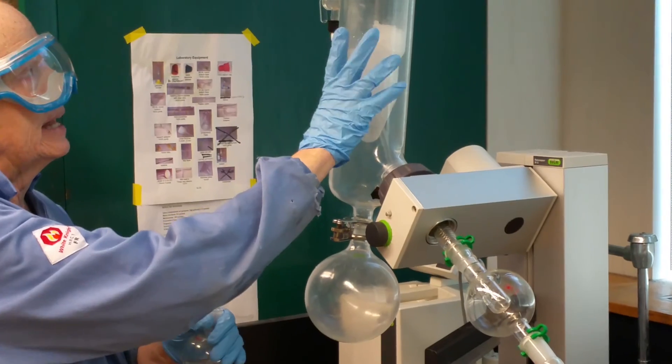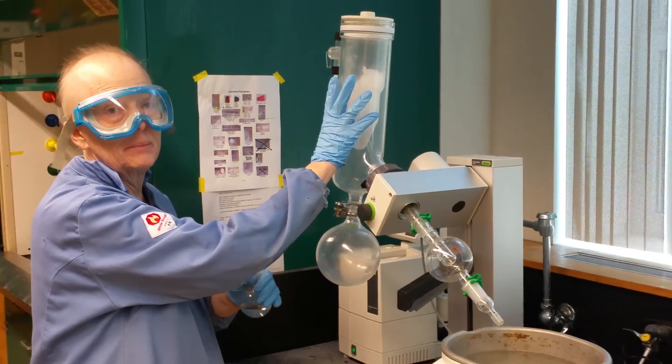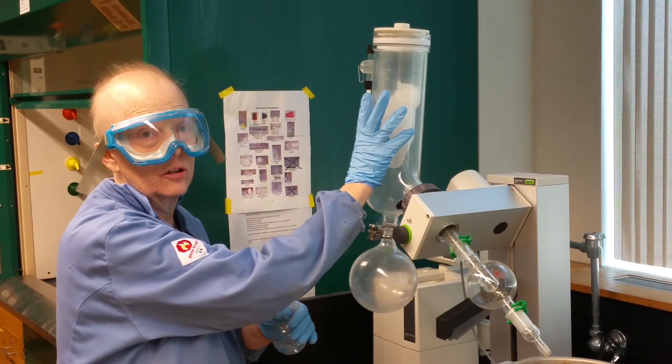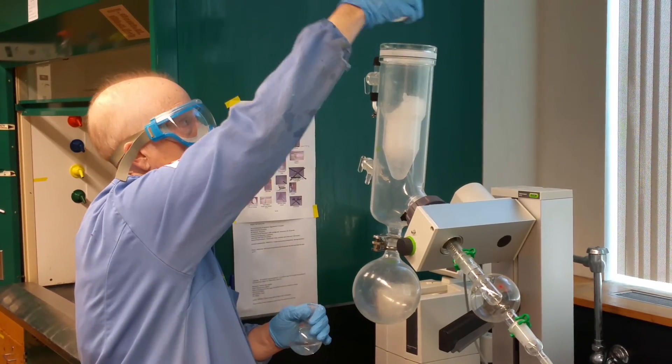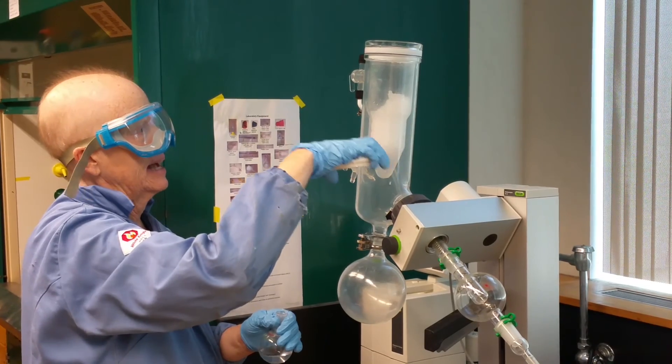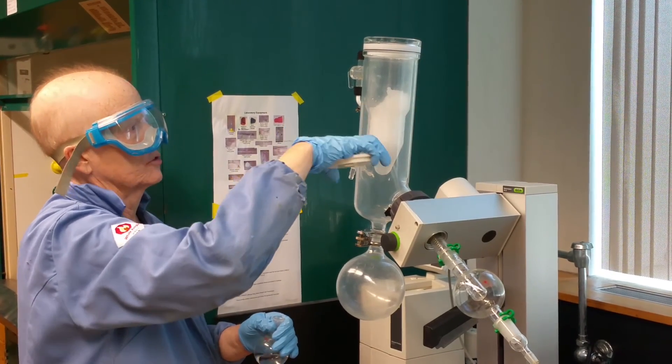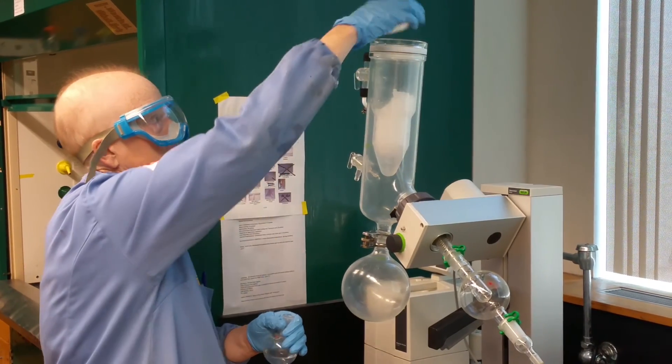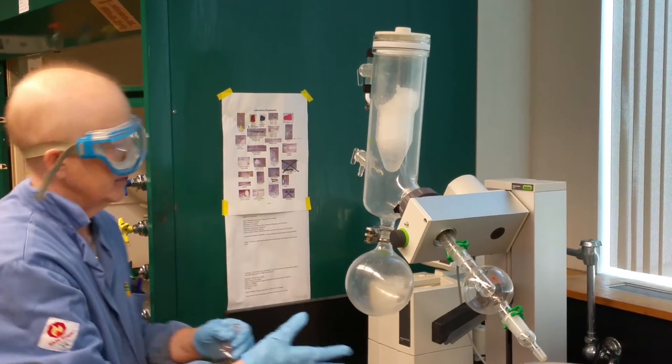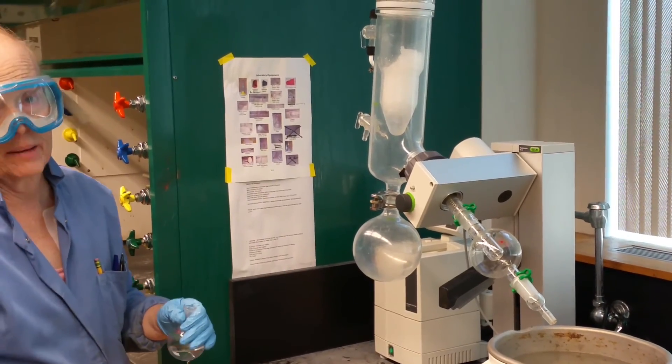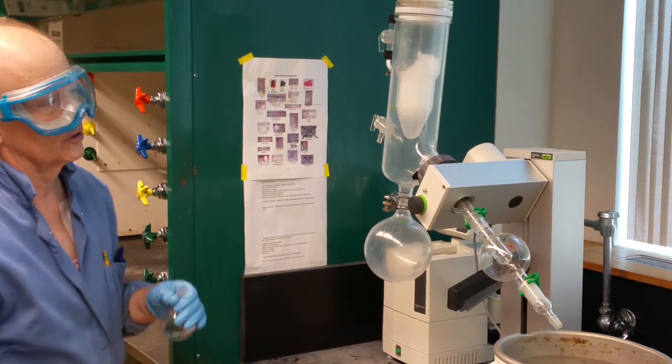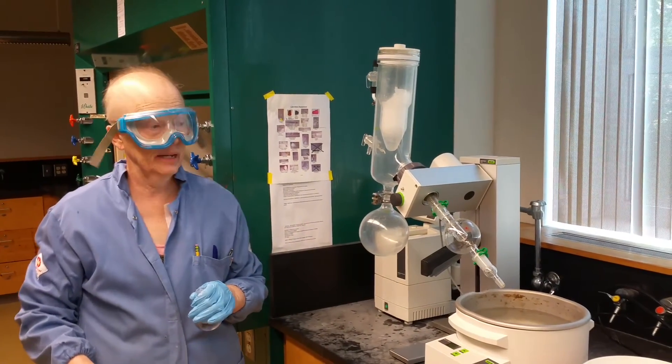How do you work the rotary evaporator? Let's make the comparison. This is the heater, but it only goes up to very low temperatures. This is going to be the pot, and I have a liquid in the pot. This is the condenser, and in lab this will typically be filled with dry ice and acetone, which is at minus 78 degrees. It's like an inner chamber.